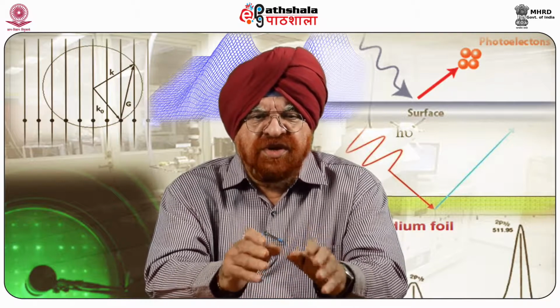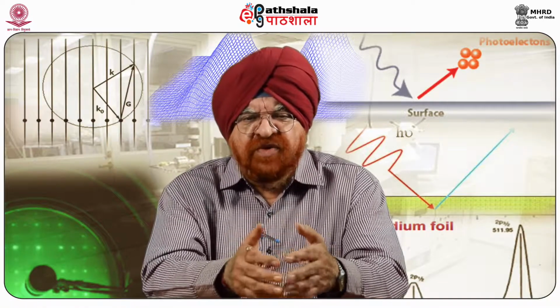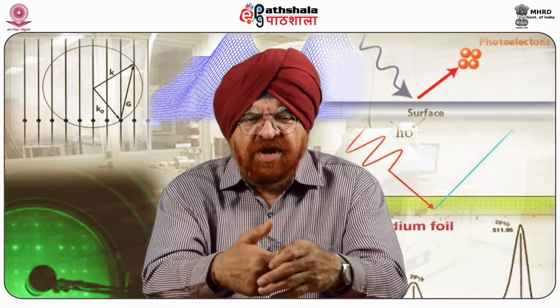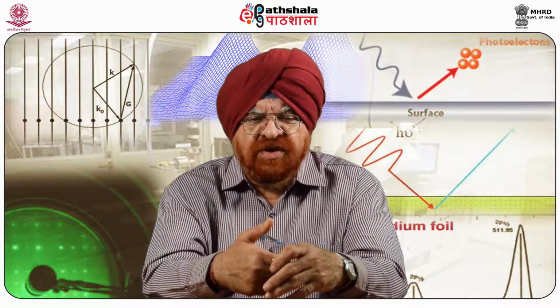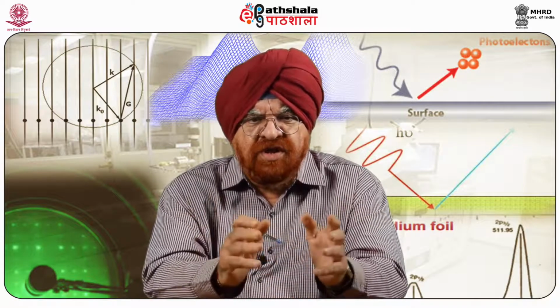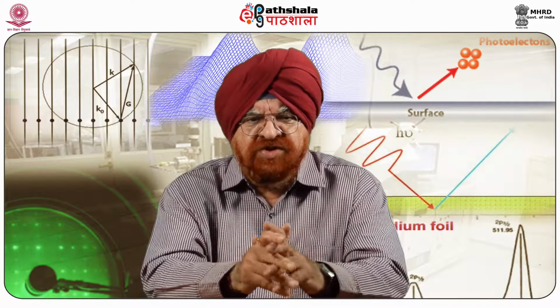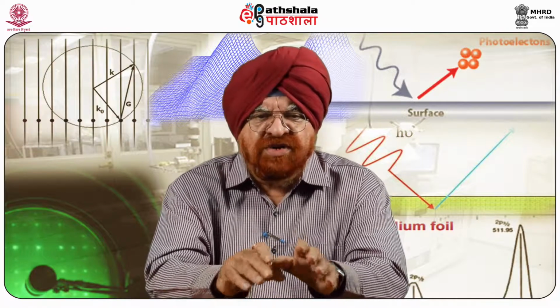The Mn-free GeMn 3.7 and GeMn, that is germanium manganese 24% film, deposited on crystalline quartz substrates were also investigated through similar magnetic force microscopic measurements, which was originally done by Ferri et al. in 2010.